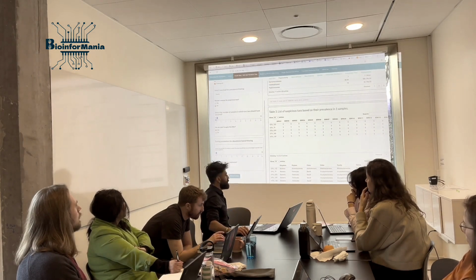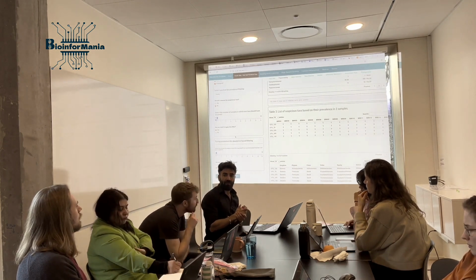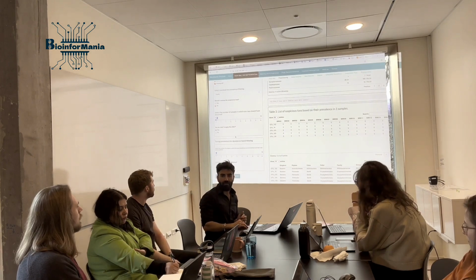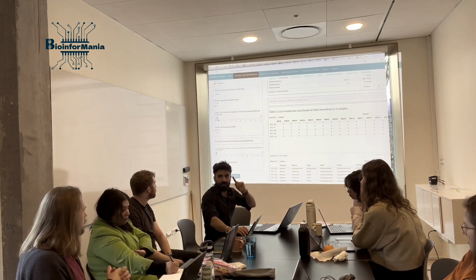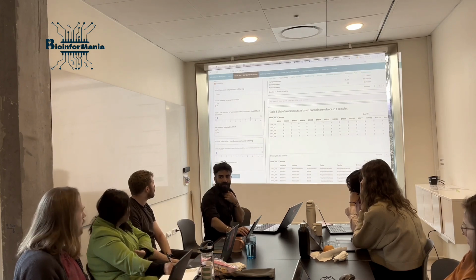But if you have a pilot study or you have collected samples from harsh environments, then don't set this one to yes, okay? So here I'm saying at least one sample should have this taxa for it not to be considered an error, okay?